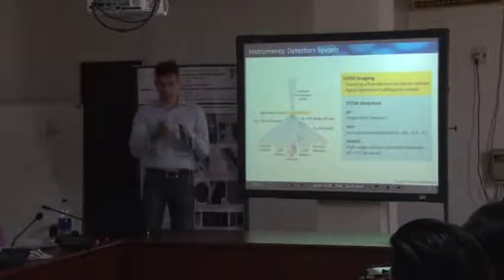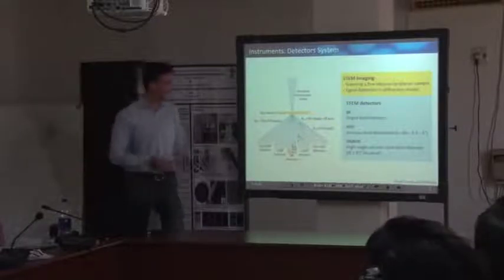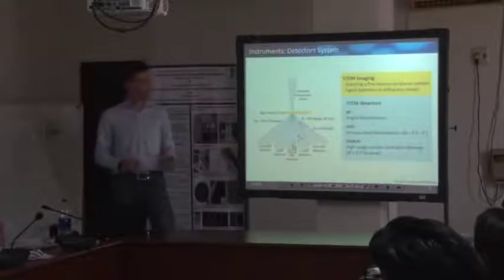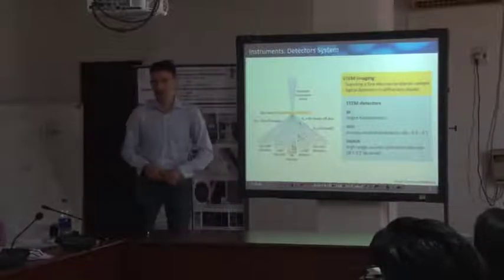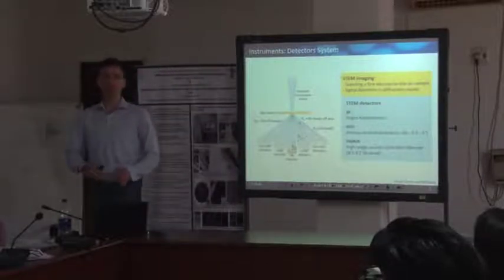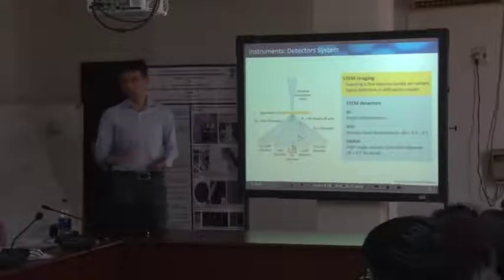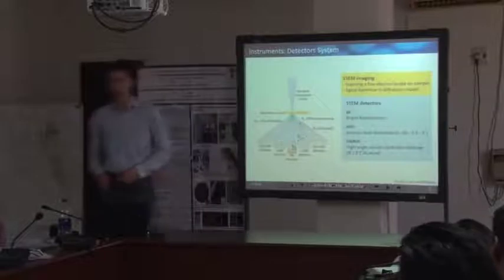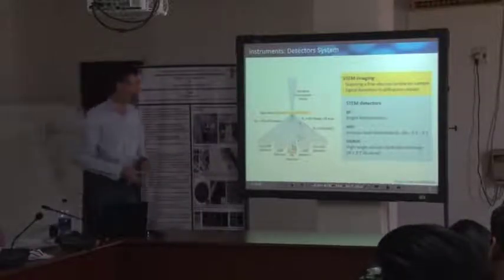As you know, the atomic scattering factor into large angles is far larger for heavy elements, so it's always easy with this Z contrast imaging. Using this HAADF detector, it's far easier to detect the distribution of heavy elements, not of very light elements. So for light elements, there is more scattering in the forward direction than into larger angles. This is why we also need a bright field detector.